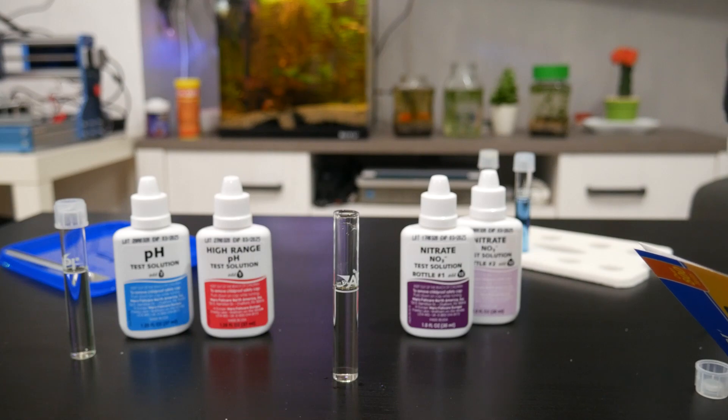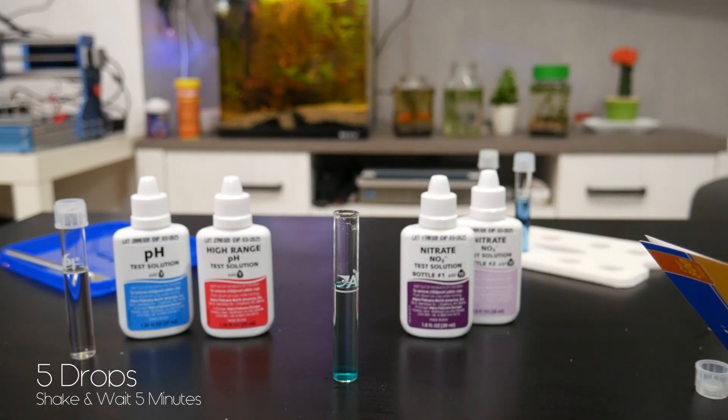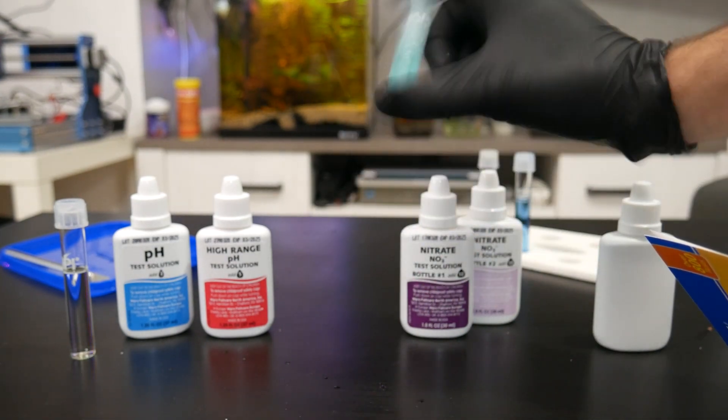The next test is nitrite. We need five drops from one bottle. With this test we also need five minutes until we can read it.